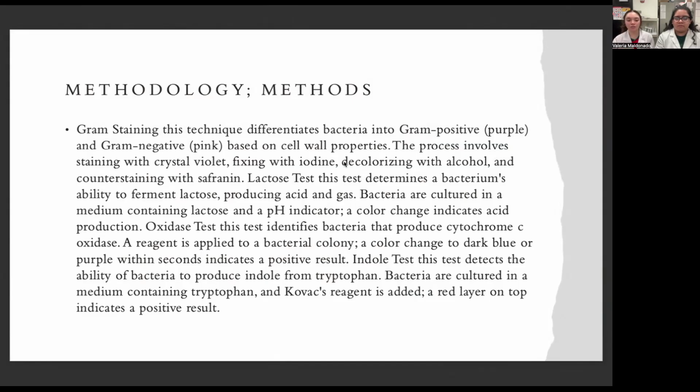And then after the lactose test, we did an oxidase test, which identifies the bacteria by a color change. After we add the reagent, if it turns dark blue or purple within seconds, it is a positive result. If it does not, then it is a negative result.